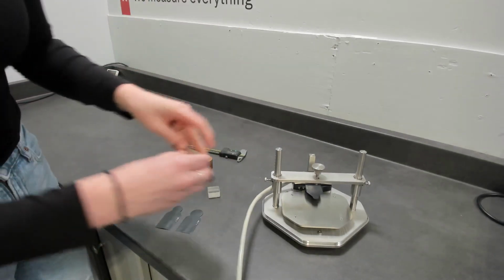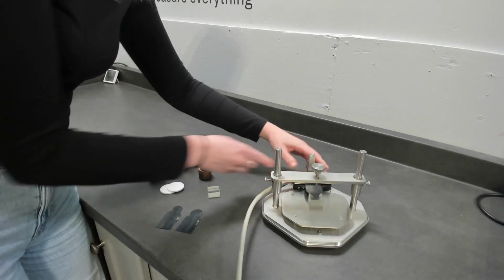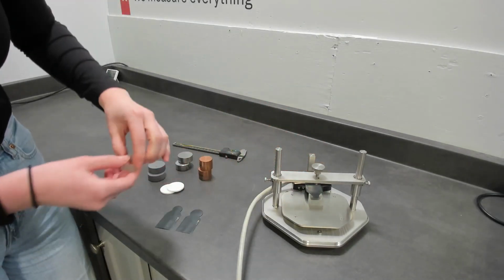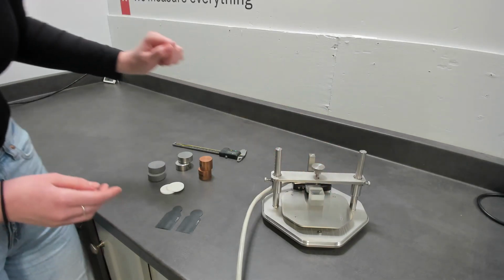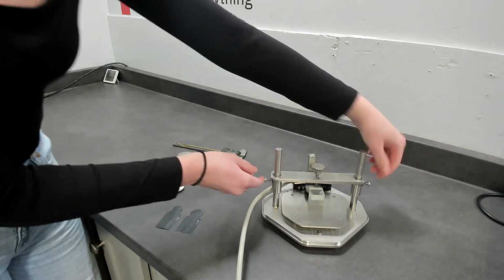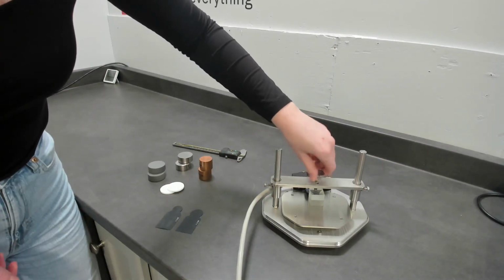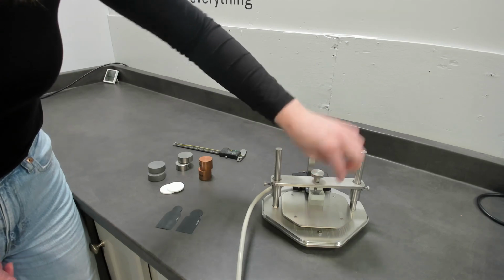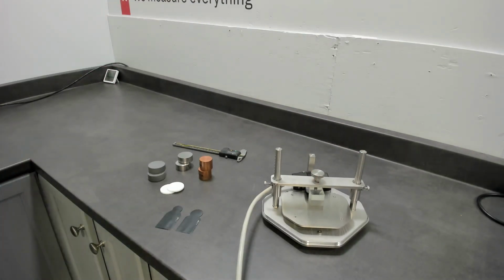Then I can take one of my Pyrex samples, place it underneath the sensor, and adjust the height of the adapter so that the sensor lays flush with the top of the sample. And then I'll place my other piece of Pyrex sample on top. Perfect, and then I can just clamp this together to ensure good contact between the samples and the sensor. And I'll just jump back over to the software and let iTPS finish the rest.